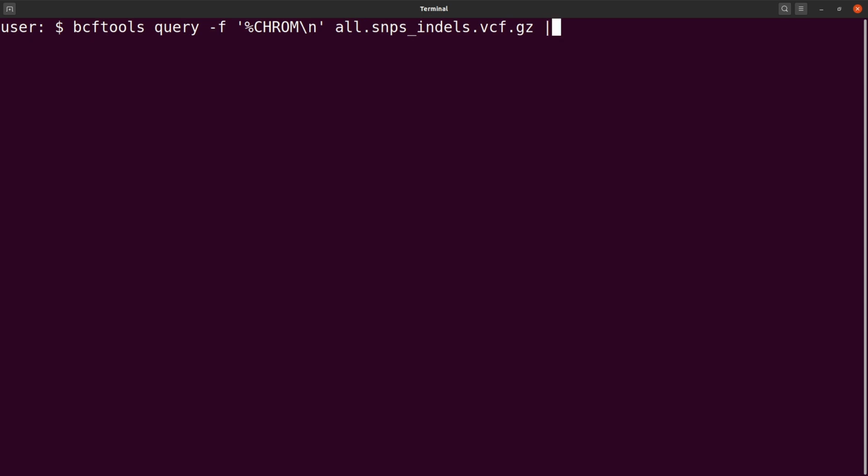And then this time we add unique and then we add wc -l. Okay, so we pipe twice. The first pipe will remove duplicates and the second one will count them for us. So let's see how this is done. Let's run it. So you will have 24.